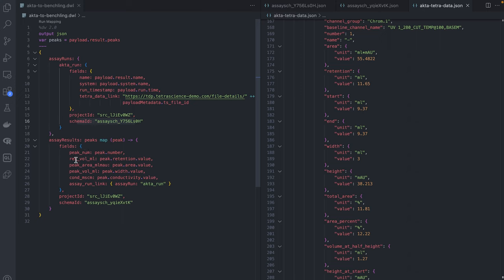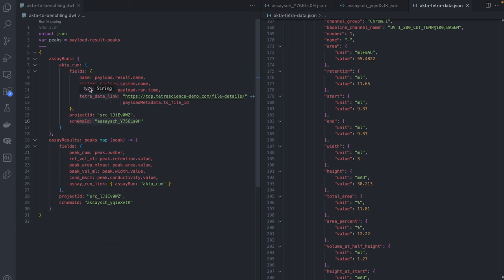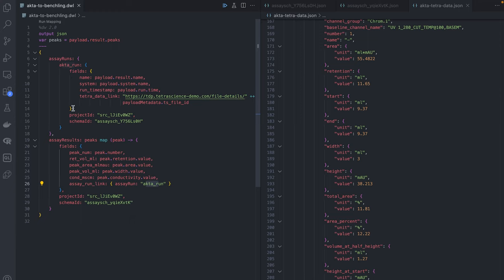We've got peak number, peak retention volume, peak area, peak volume, and conductivity. And then finally, at the bottom, we have a link back to the assay run we created earlier. Here we reference it by name. This gets translated into the proper Benchling ID once the assay run is uploaded.